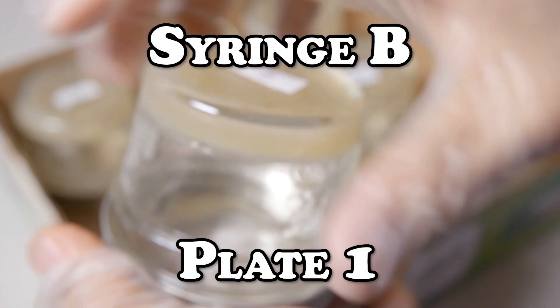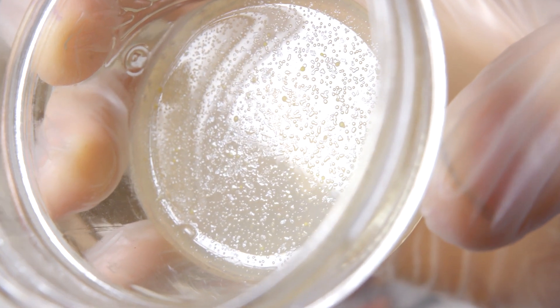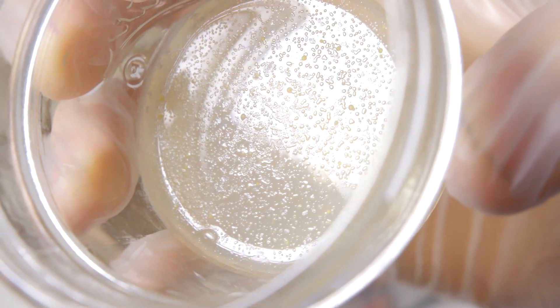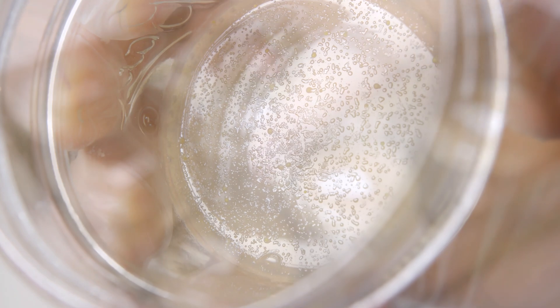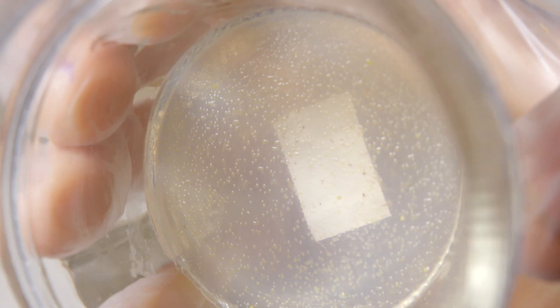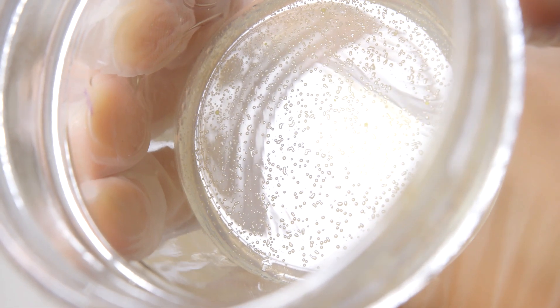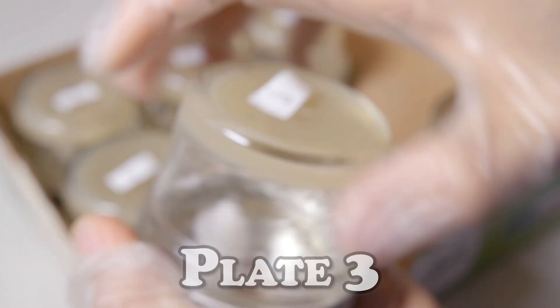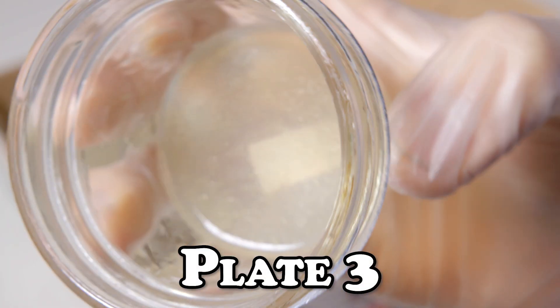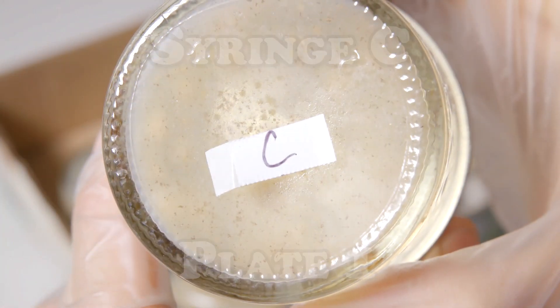As we get into the first plate of syringe B, immediately we see bacteria have consumed the entire plate. Not a single strand of mycelium is growing despite the large amounts of spores that were added. This is great because now we can finally see why our syringe B spawn bag had degraded so rapidly before it was treated with antibiotics. As we open up the second plate you'll see that we still have no mycelium. There are many factors that can contribute to this during the manufacturing of each individual syringe, but without actually being able to witness how the spores were harvested and the syringes made we can't be sure at what part of the manufacturing process this bacteria was introduced. With the third plate being viewed and no difference seen, we seem to have hit a roadblock with this syringe. Luckily we do have our antibiotics, so later we'll see if we can clean it up on a plate treated with gentamicin.